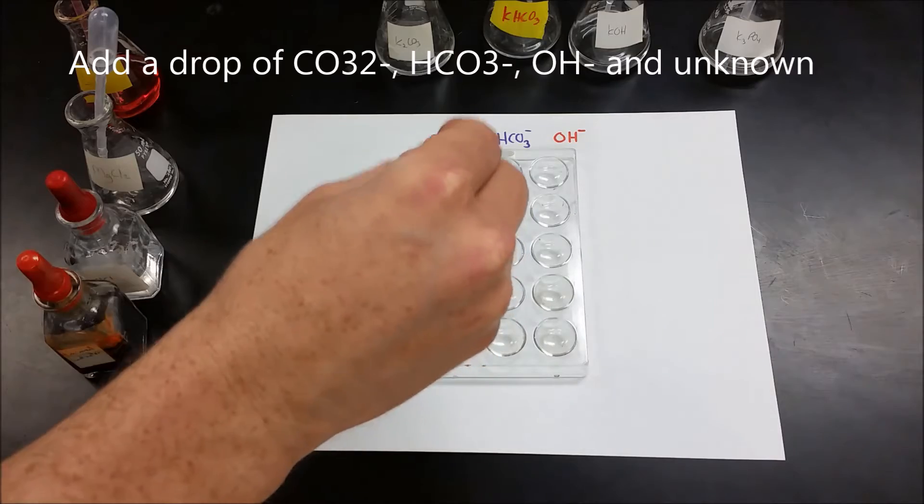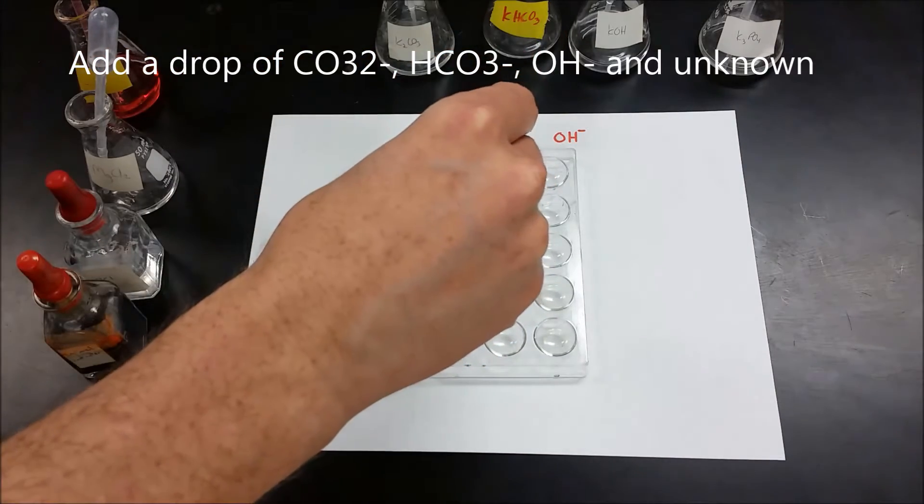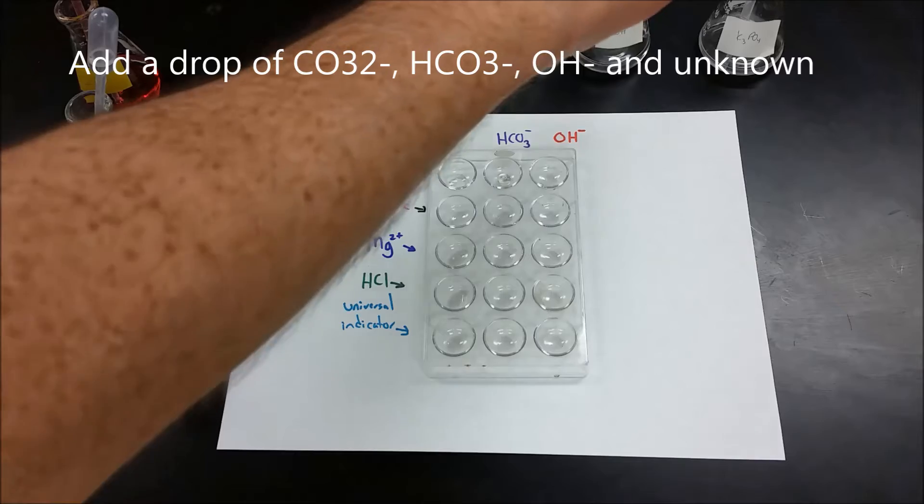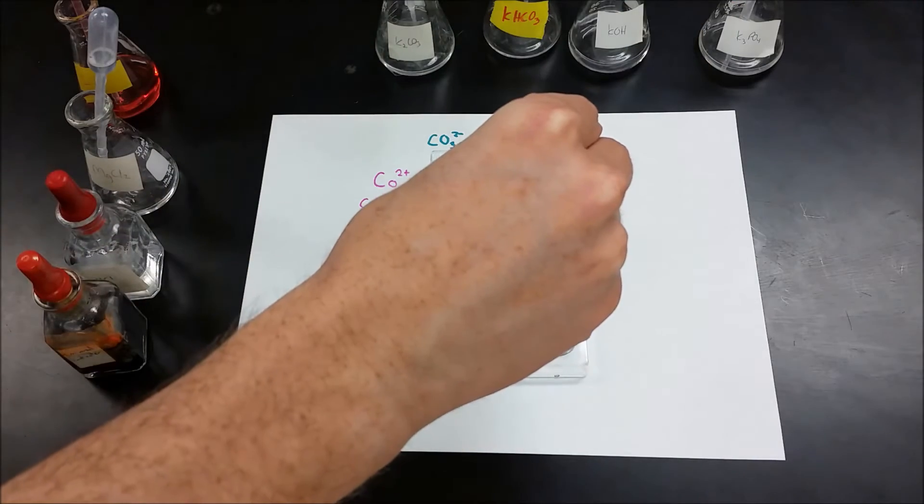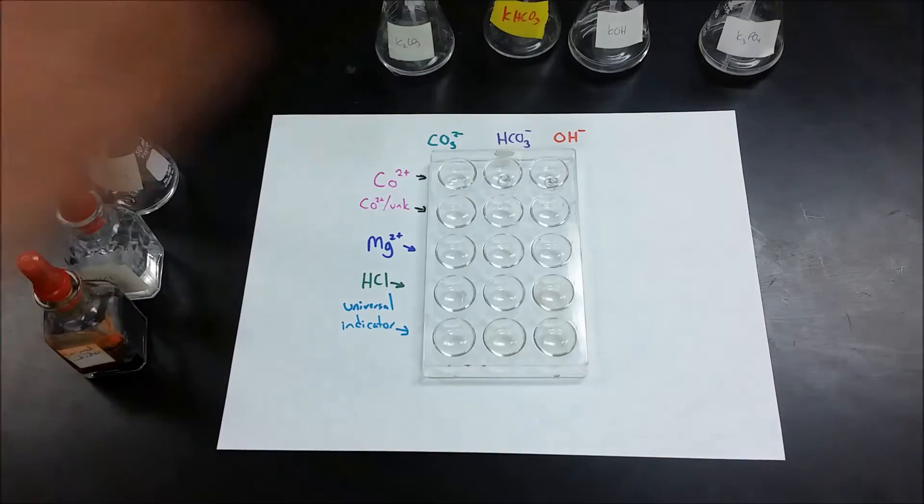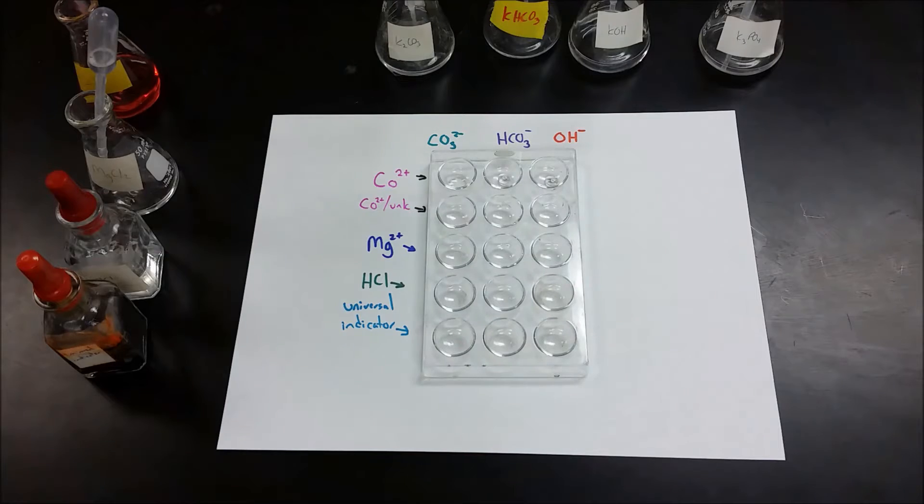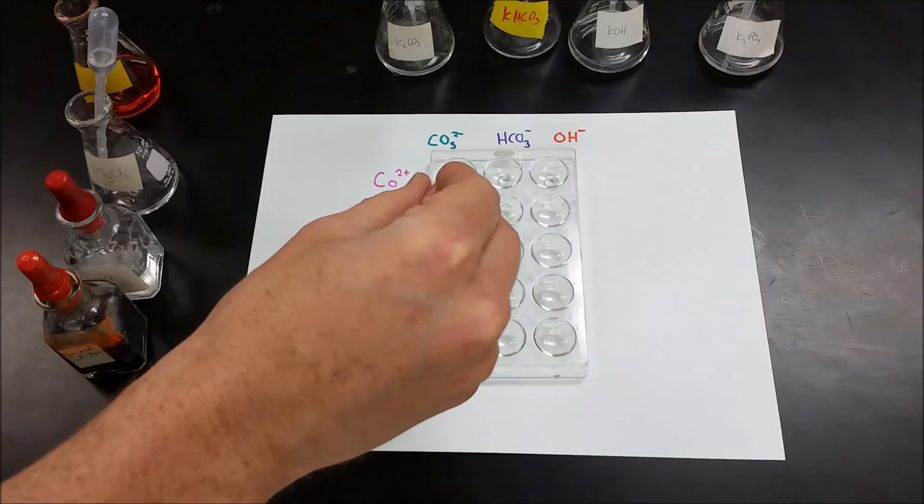First we're going to put a drop of carbonate in there, a drop of bicarbonate in here, and a drop of hydroxide in here, or two. Then we're going to add cobalt to each one. You can do any cobalt solution. I have cobalt sulfate here.